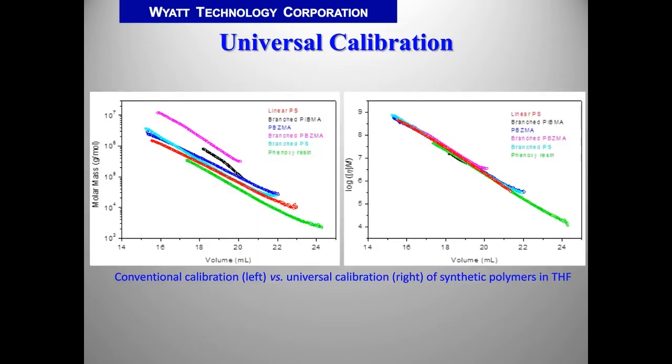Okay, so I'm going to turn this back over to Stepan to talk about what you can do with this device. And Stepan, please. Okay, thank you, Steve. Now we come to various applications of the online viscometer.